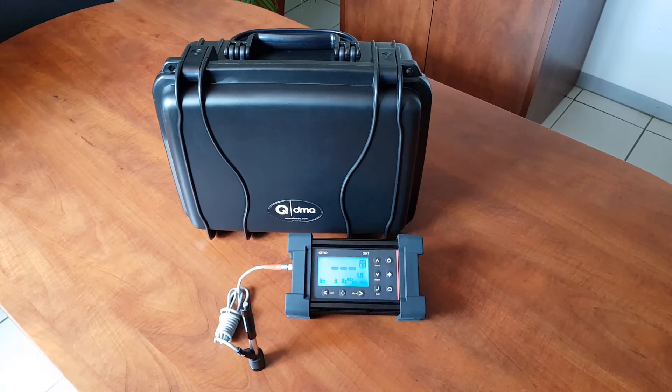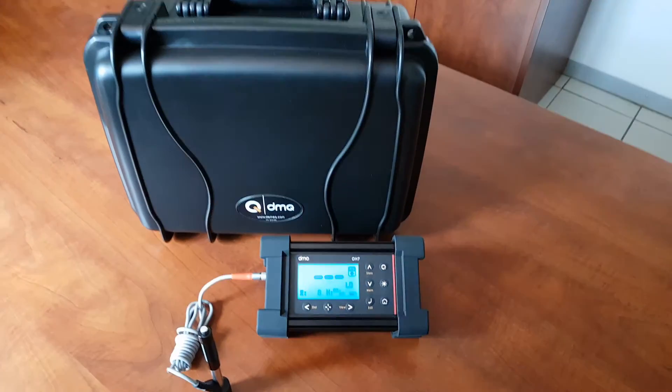The DMEC equipment includes a conformity certificate and a limited 5-year warranty on electronics.